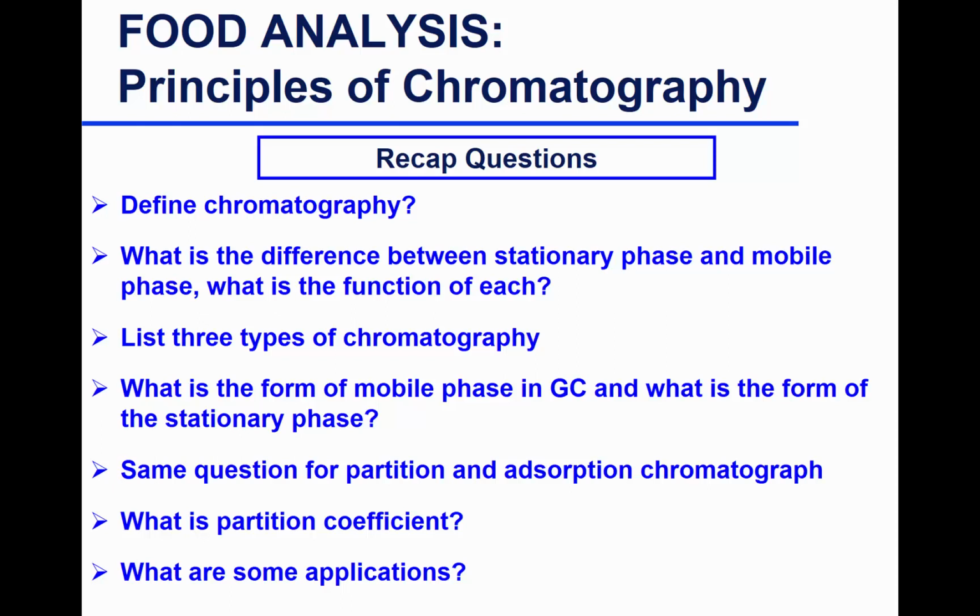Same question for partition chromatography. What would be your mobile phase and what would be your stationary phase in partition chromatography? Now, Fan? Yes, liquid in partition chromatography, and for adsorption chromatography, your stationary is solid, and your mobile phase may be gas.